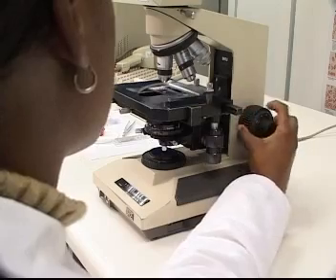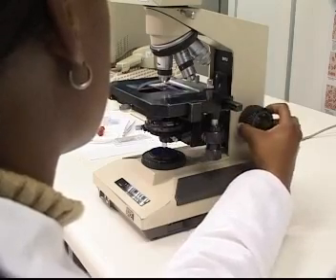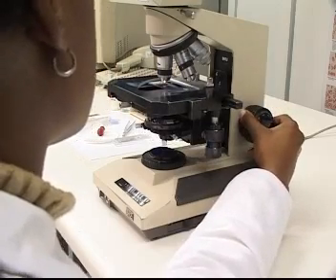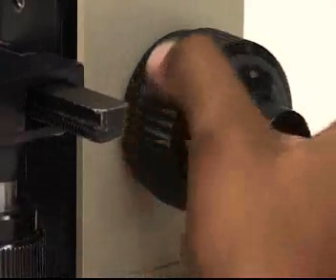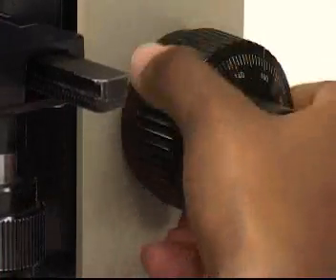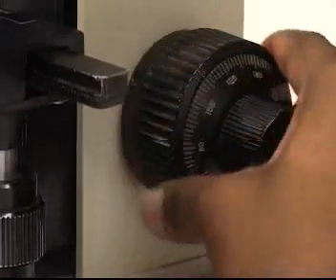Now, while looking at the microscope from the side, raise the stage with the coarse adjustment to within 5 millimeters of the slide. Remember that the coarse adjustment screw, which is this part, brings about large movements of the stage, or in some cases, the body tube.